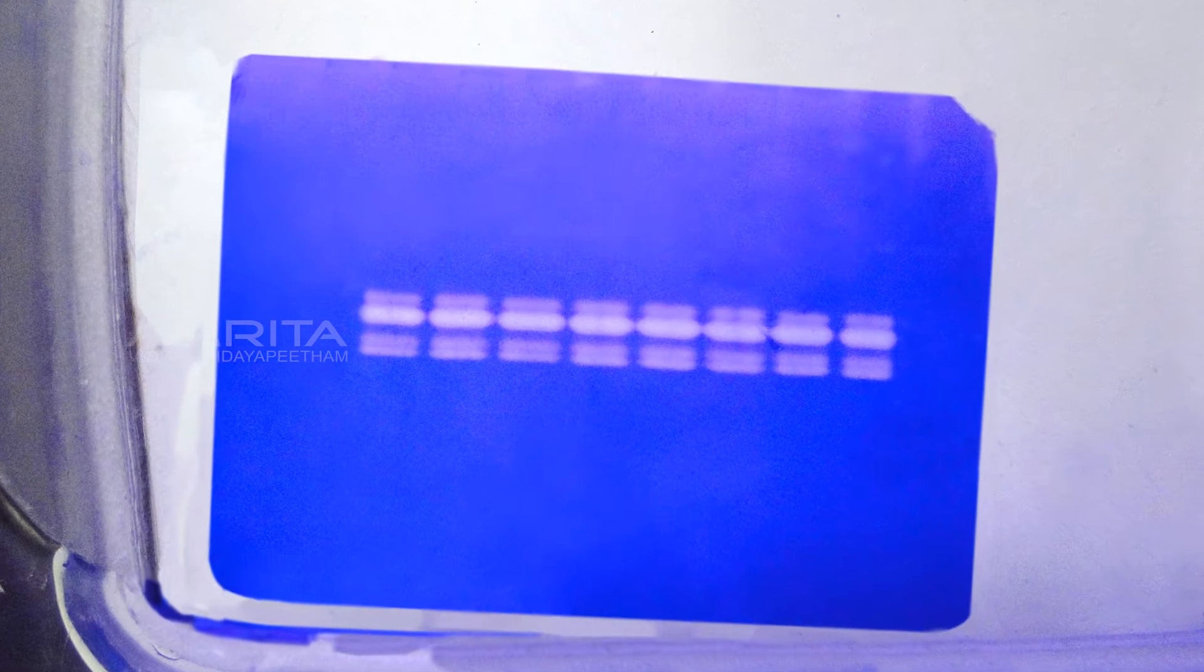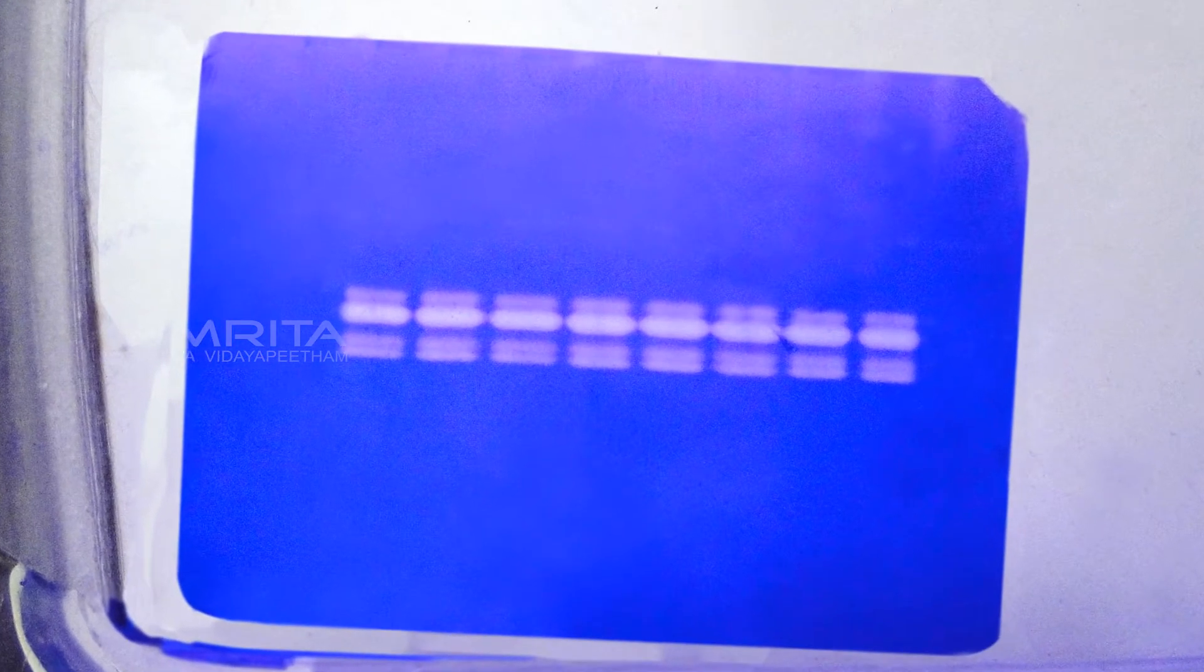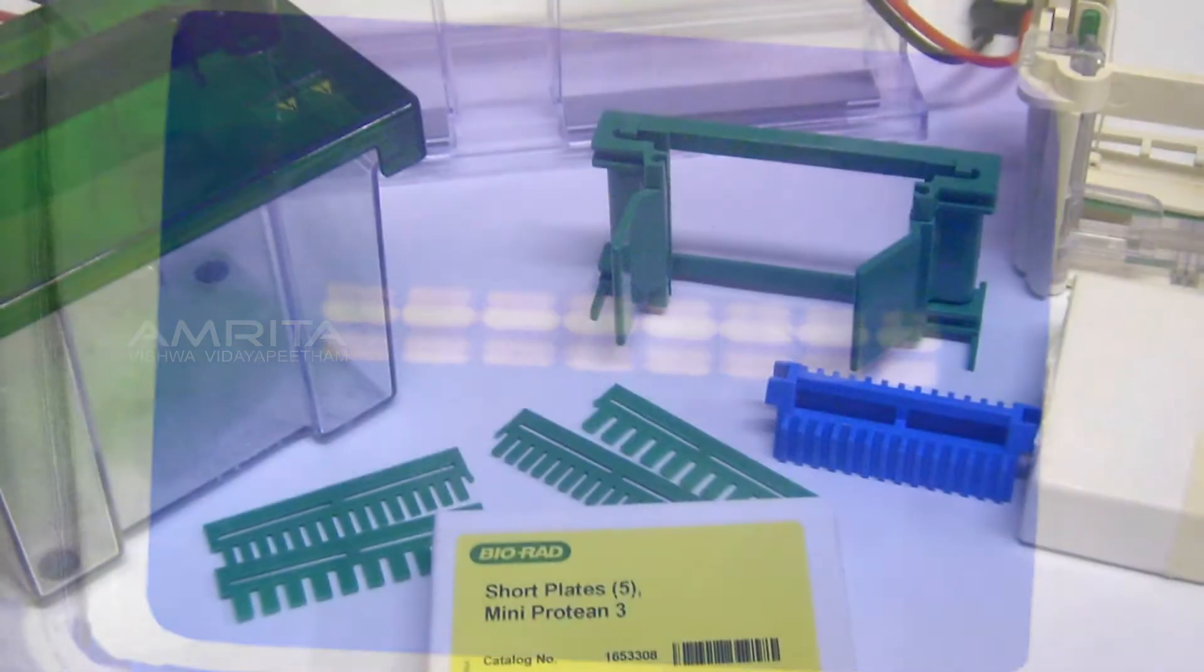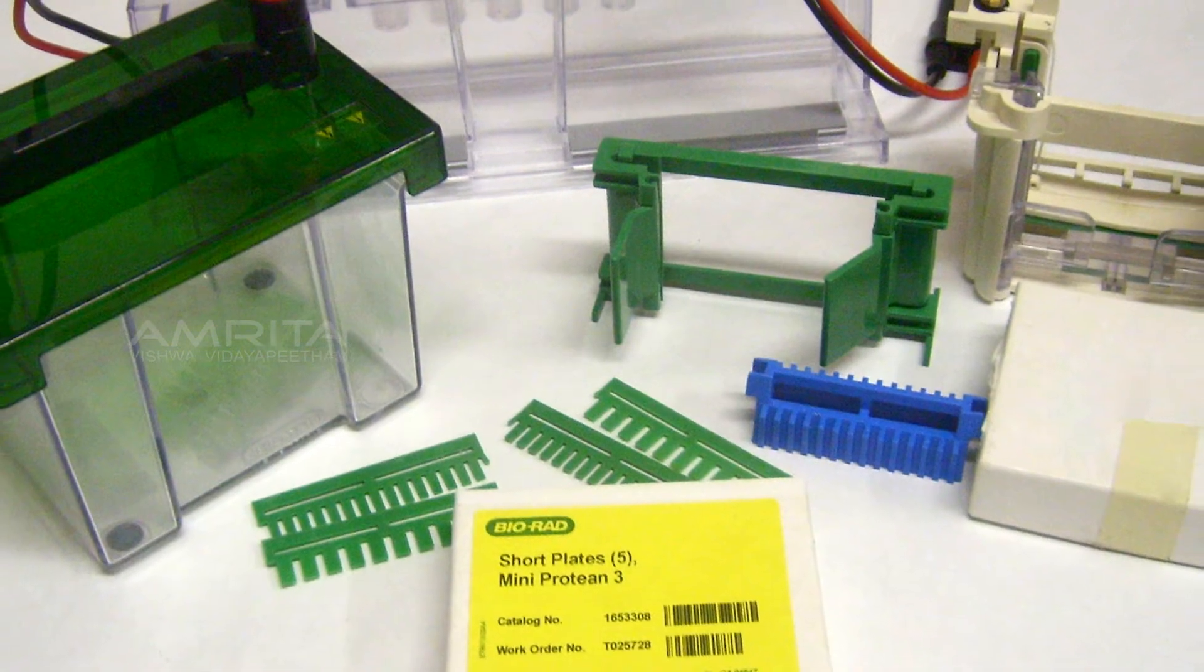Zymography is a simple, sensitive, quantifiable and functional assay for the analysis of enzyme activity in tissue or in polyacrylamide gel.